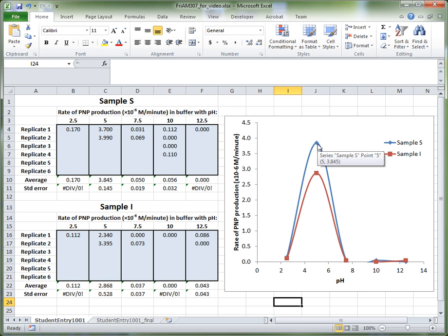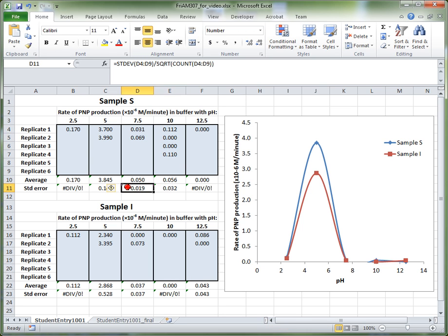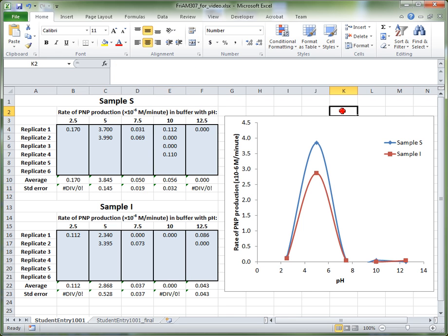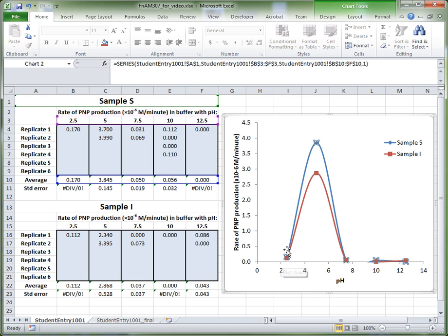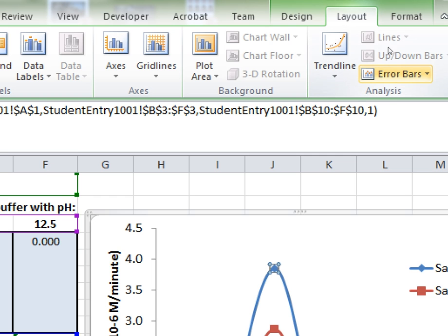Since a lot of our data here is replicate data — for example at pH 10 for sample S you have four replicates going into your data set — we have a calculation here of the error representation, called the standard error. We can put this onto our graph as error bars. To add error bars, click onto your series — for example the sample S series — which will select the blue line. Then go up to Chart Tools Layout and choose the Error Bars option.